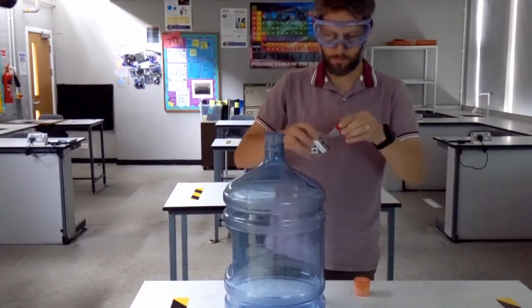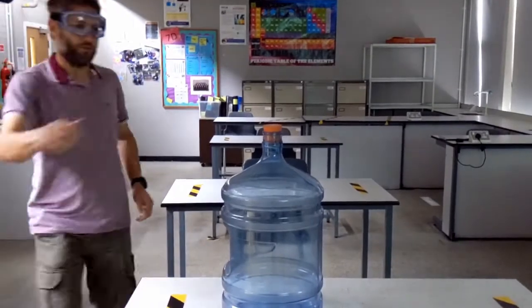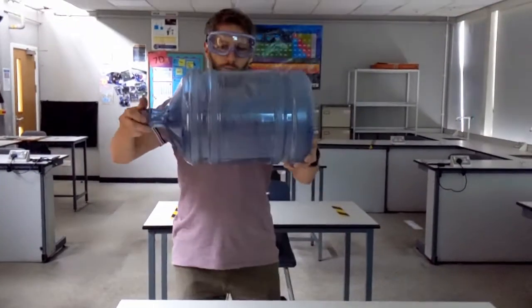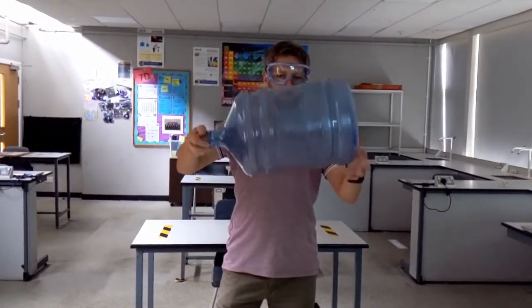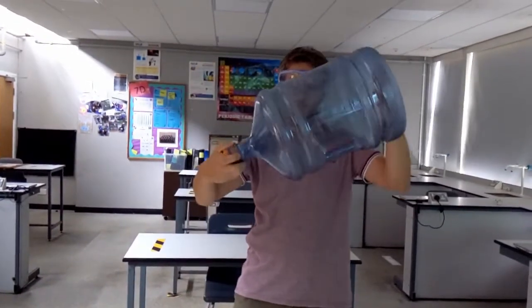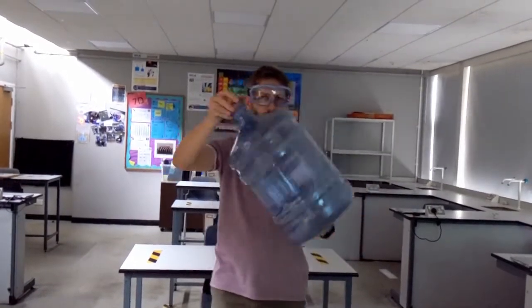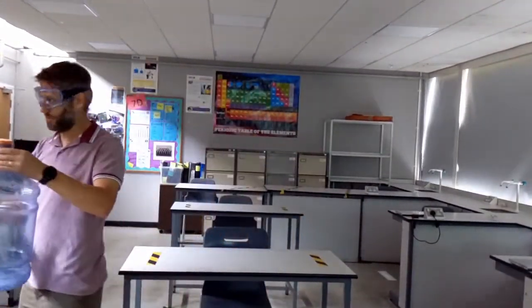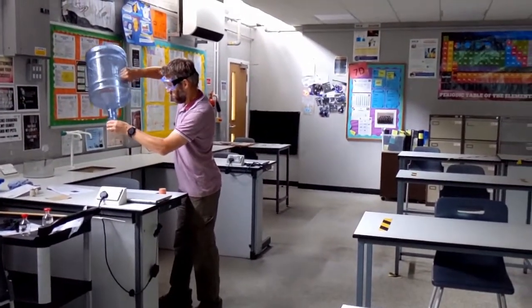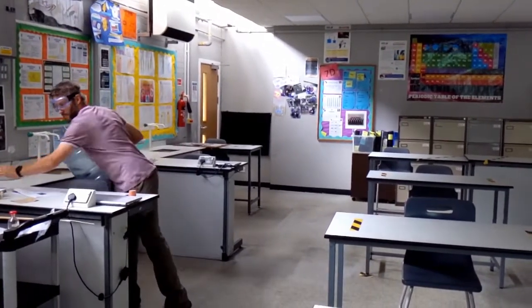I'm going to put a stopper on. I'm going to put that over there. Let's just roll it around for a few seconds. So all we're doing is rolling that fuel around in the bottle, making sure it's spread out and everywhere within the bottle. So we've got lots of it in there. Can't really see it because I only put a little bit in, but it's spreading out the vapours. Now I'm just going to see if there's any extra in it that I need to get rid of. A little bit there, I've just taken that out.